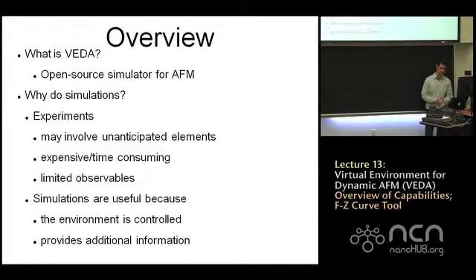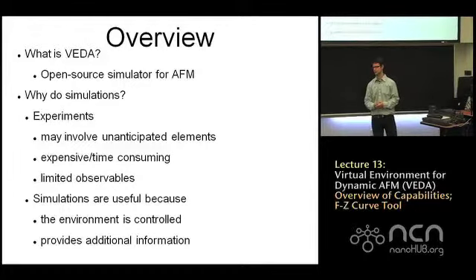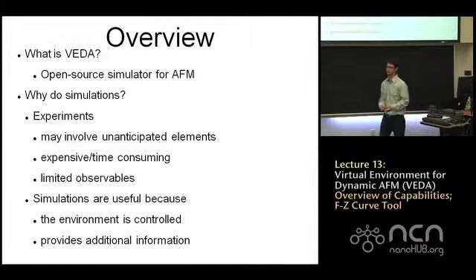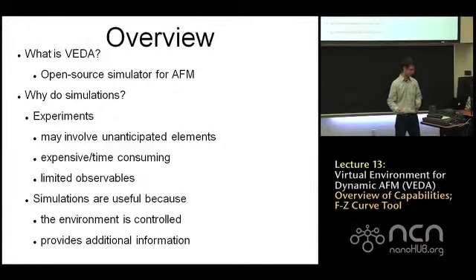So the simulations are useful because, one, we have a controlled environment. We know exactly what's going to happen, and it's up to us to interpret the results of the simulation. But we know that the sample is what we specified in the inputs to the simulation. We have a very controlled environment. And secondly, we have information beyond what the observables in AFM record. So things like indentation and contact time, specifically, several of these will be more relevant to dynamic AFM, but just something to keep in mind.